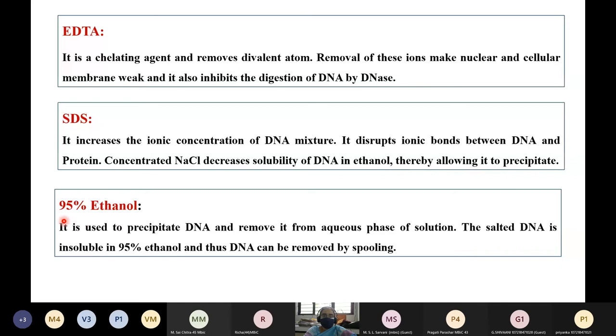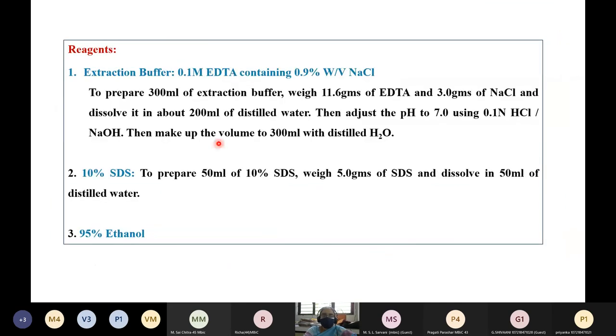Finally, for precipitation, 95% ethanol is used to precipitate the DNA and remove it from the aqueous solution. The salted DNA — having had sodium chloride added in the first stage — is made insoluble in 95% ethanol, and this DNA can be removed by spooling.